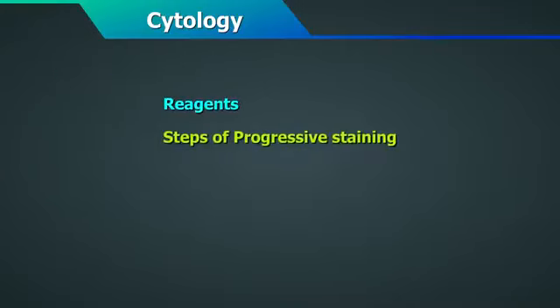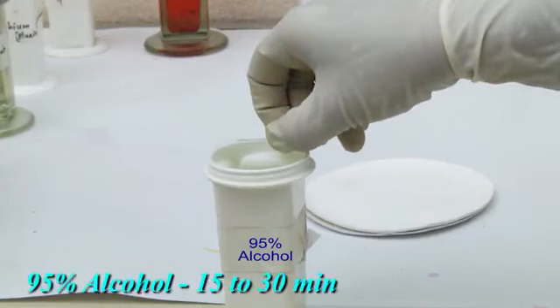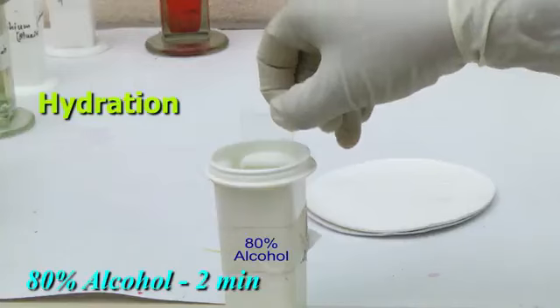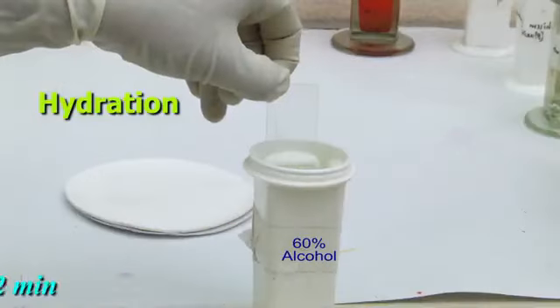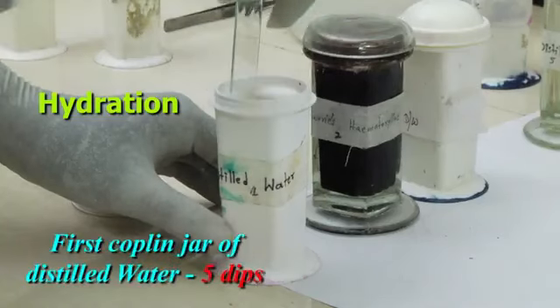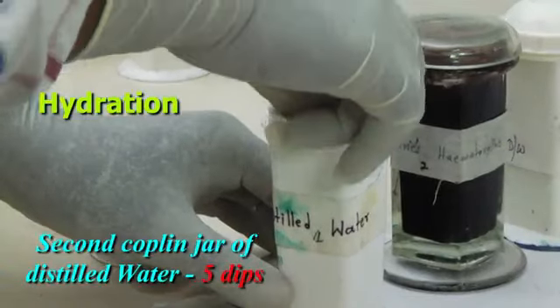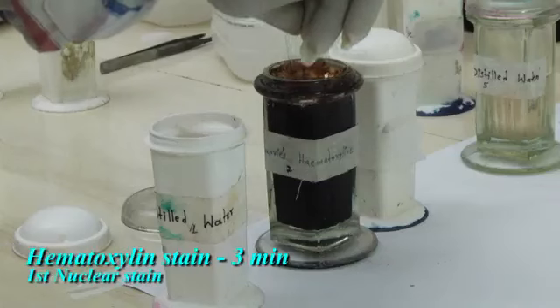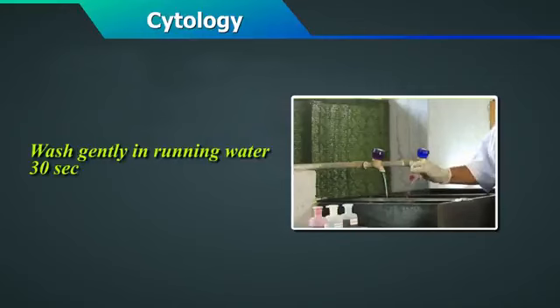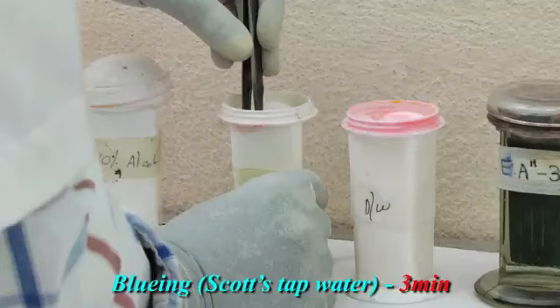Steps of progressive staining. 95% alcohol for fixation, 15 to 30 minutes. Hydration in 4 steps. 80% alcohol, 2 minutes. 60% alcohol, 2 minutes. In the first Coplin jar of distilled water, 5 dips. And in the second Coplin jar of distilled water, 5 dips. Hematoxylin stain, 3 minutes. Wash gently in running water for 30 seconds. Bluing with Scott's tap water, 3 minutes.